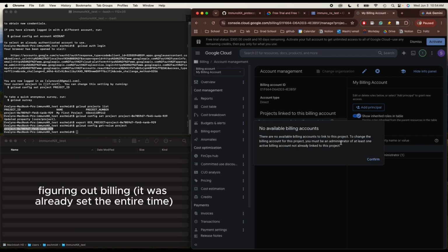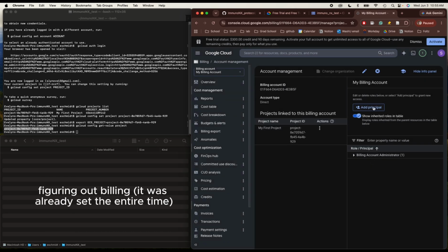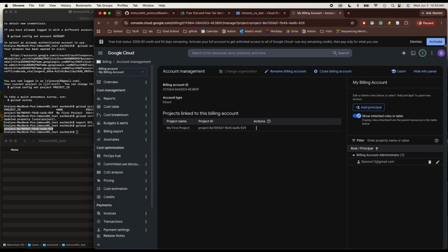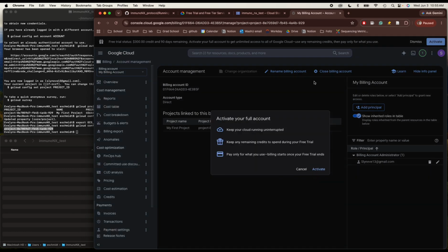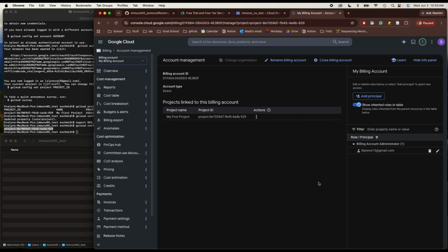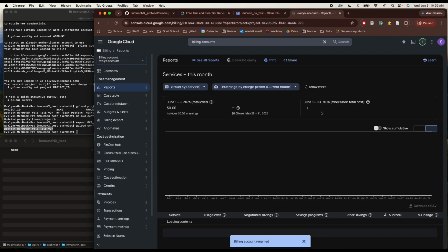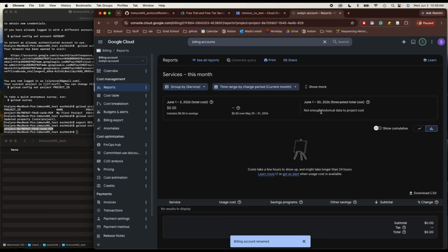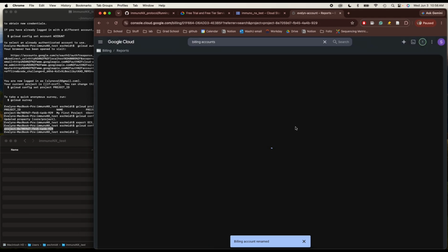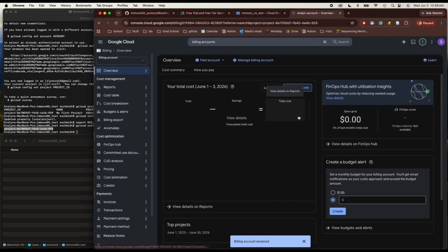I don't have it. All right, let's activate. Project's linked. Maybe it's already linked. We will see if we get an error later.